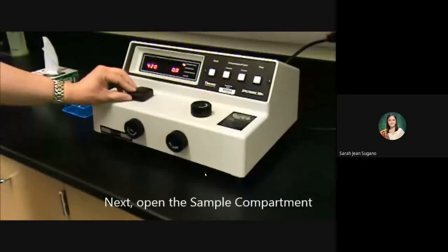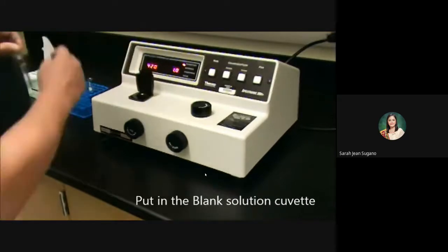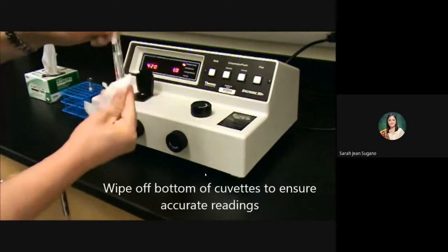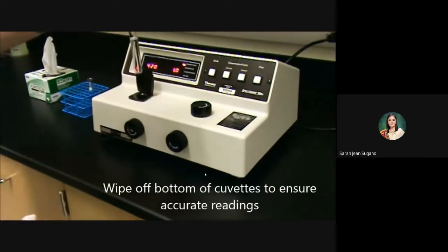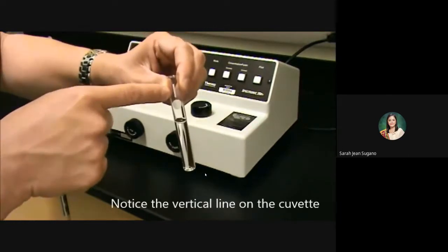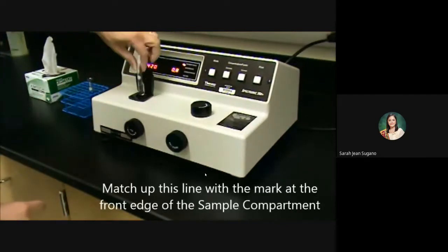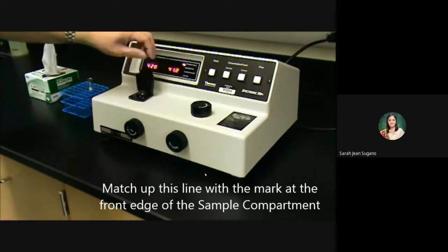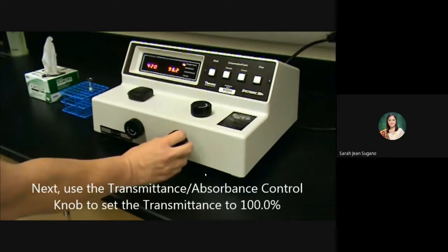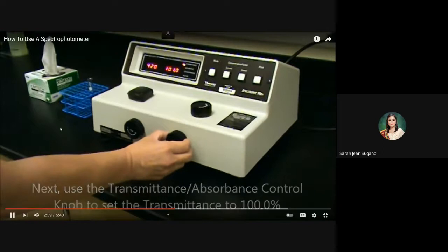Next, open up the sample compartment and put the blank solution in. You should always wipe off the bottom of your cuvettes before you insert them in the machine to make sure that nothing interferes with the reading. Also notice that there's a little line shown on the front of the cuvette. Line that up with the dash on the front of the sample compartment, insert it all the way inside, and then close the sample compartment. This time you're going to use the absorbance transmittance control and turn it one way or the other until you get 100 on the dial.